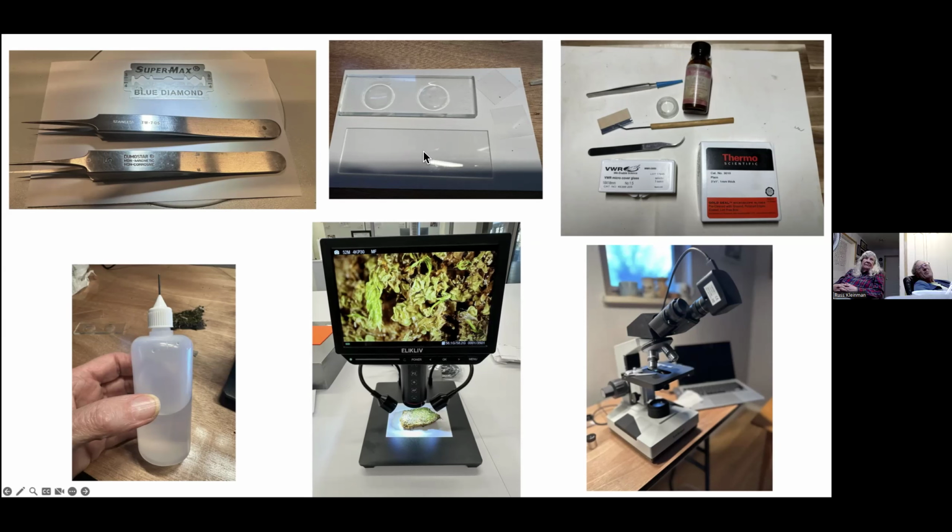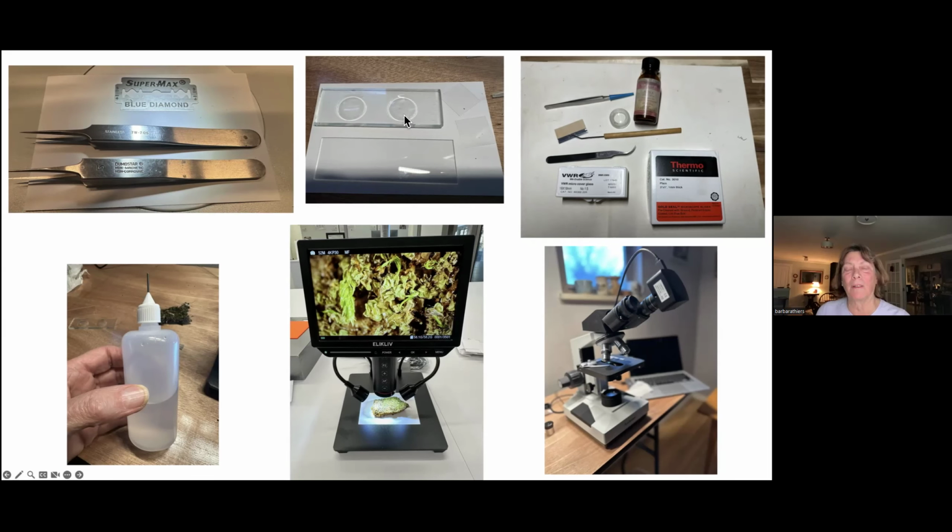I use, obviously, a microscope slide and cover slips like everybody. I have a supply of what are called depression slides. I inherited these in grad school and I've had the same 10 or 12 ever since. They're slides with a depression in them, and I use those for my initial sorting and wetting up of things. Like I say, not everybody uses the same tools.